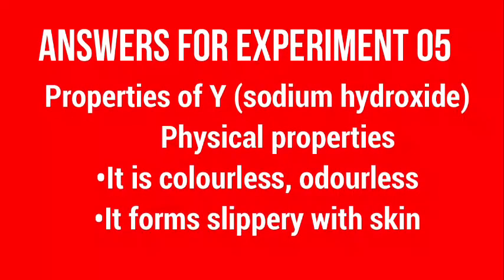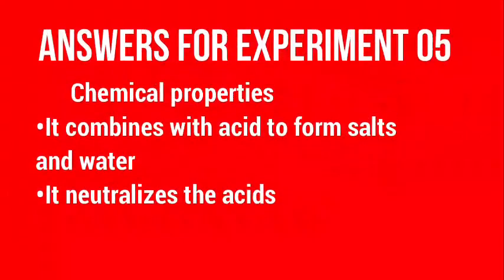Properties of Y, which is sodium hydroxide. Physical properties: it is colorless and odorless. Another, it feels slippery on the skin. Chemical properties: it combines with the acid to form a salt and water, and it neutralizes the acid. That is our properties of sodium hydroxide, or properties of the Y solution.